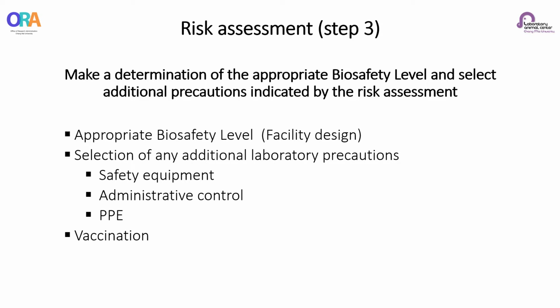Vaccination does not substitute for engineering and administrative risk mitigation controls. Risk mitigation requires finding a balanced approach that includes ongoing hazard identification and review of control measures, with a commitment at all levels to reduce identified risk to the level acceptable to the institution.